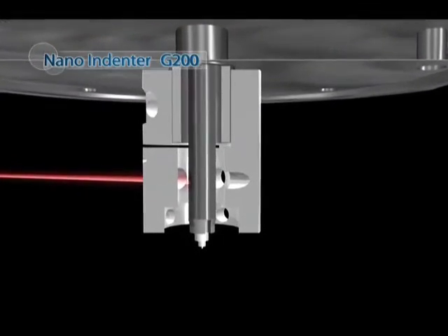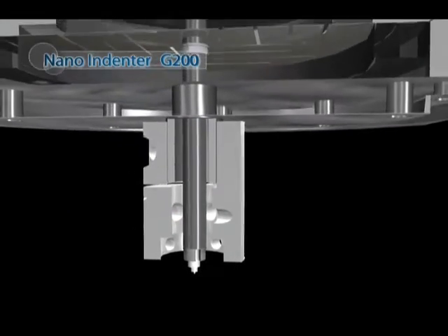For tribology applications, two fiber-optic gauges are used to resolve X and Y forces.